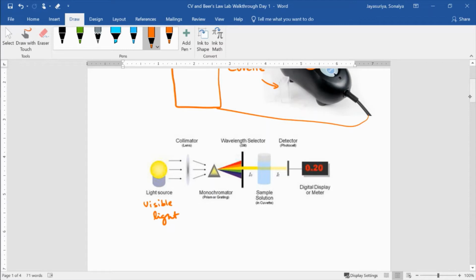And then they have something, I don't know what exactly is in this colorimeter, but they have something that is able to split apart that white light. So visible light, when all the wavelengths are together, is white light, right? But if you use something like a prism or some kind of diffraction grating to diffract the light, meaning bend the light, okay, the wavelengths will separate into the colors of the rainbow, basically, right?